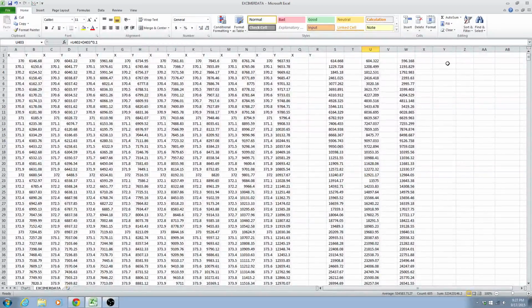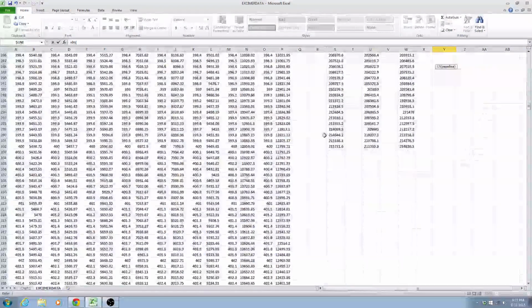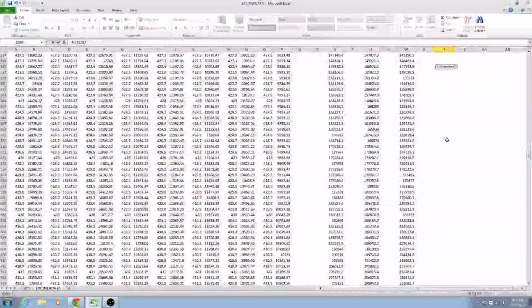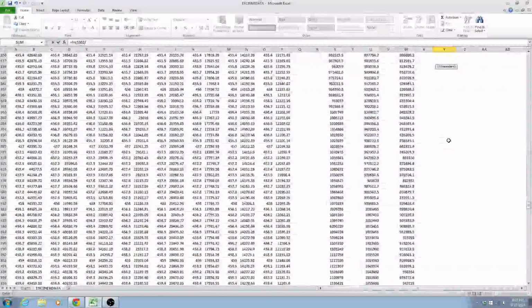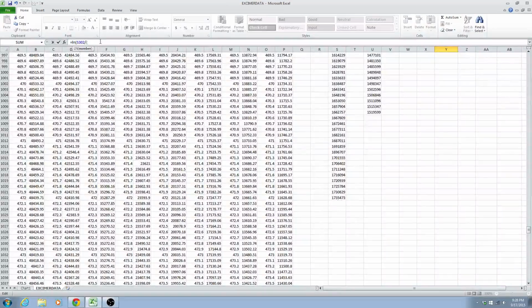So I go right here, equals natural log of that divided by the lower intensity, the monomer intensity, the one that's down here. And this one, I integrated half of it, so I just want to multiply it by 2, and that should be the full thing.